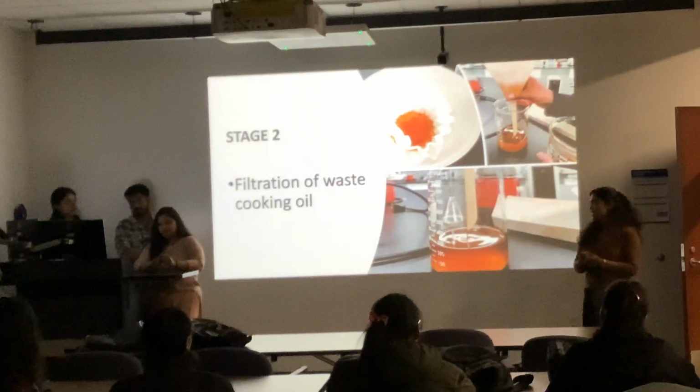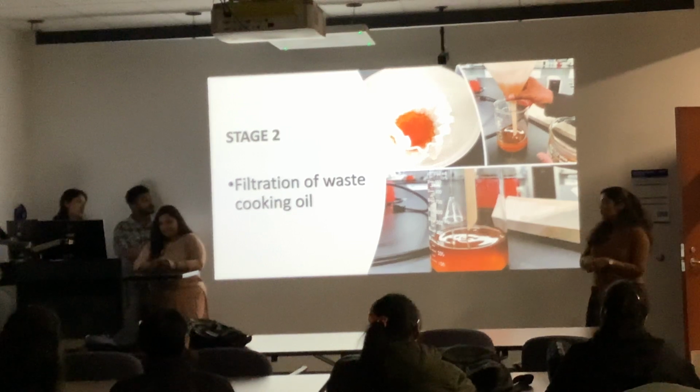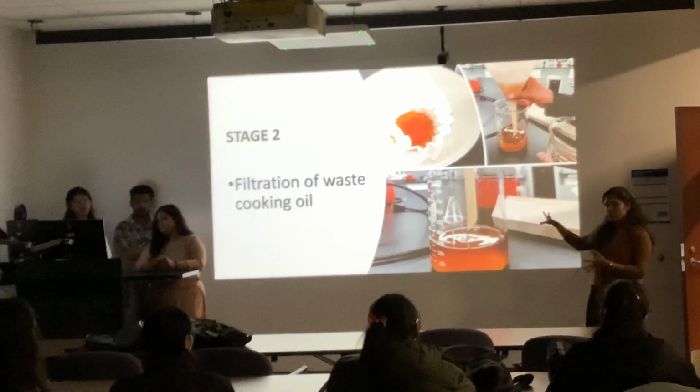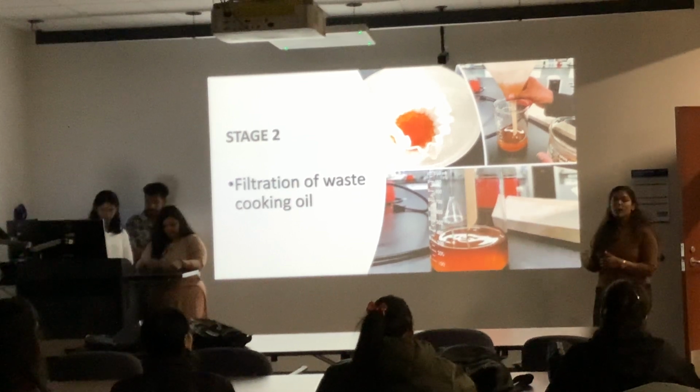The second stage is the filtration of the waste cooking oil. The filtration took about half an hour. Here you can see the images of how we filtered the waste cooking oil. The next step will be discussed by Ashwati now.